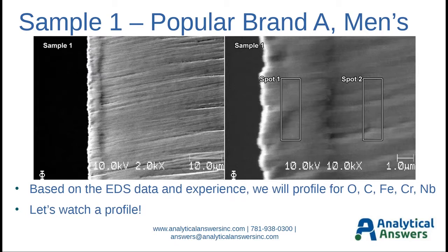So now we put the first blade sample into the Auger system. This is a scanning electron microscope picture on the left at 2000x, just showing that blade edge. And of course, when you look at a razor blade, it looks perfect and really sharp by eye. But when you start getting up to high magnification, you can see that the grind marks are still there. You can see a little bit of rippling at the edge here that looks like there might be 2 different materials there. And so as you go to higher magnification, there's a lot more detail that, of course, isn't visible to the eye.